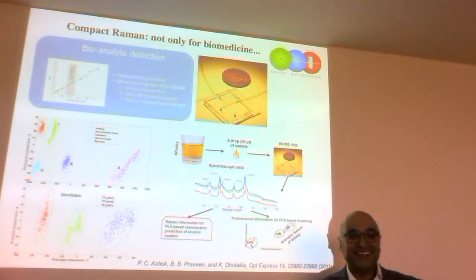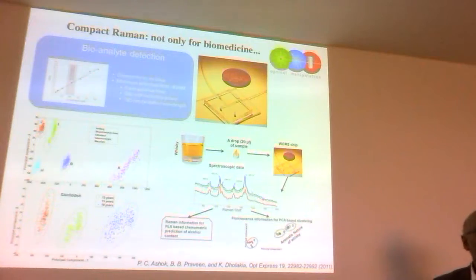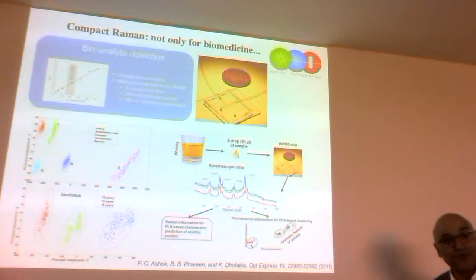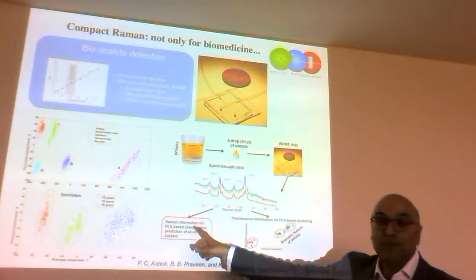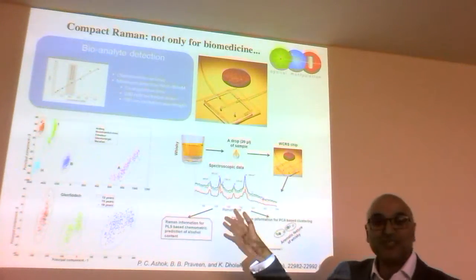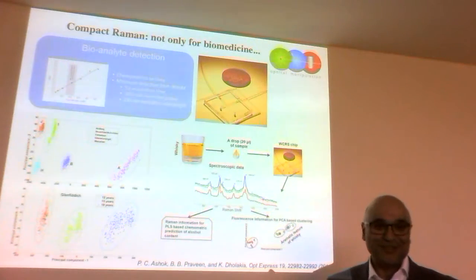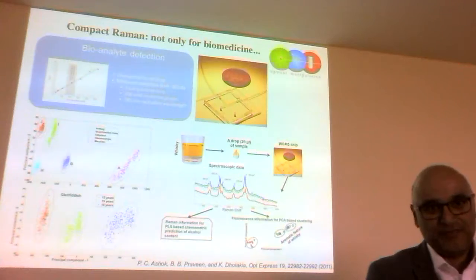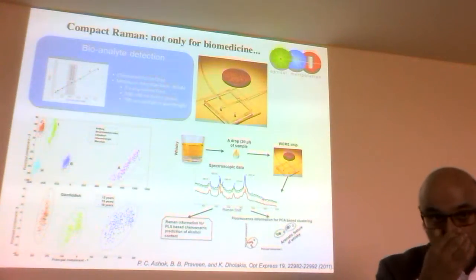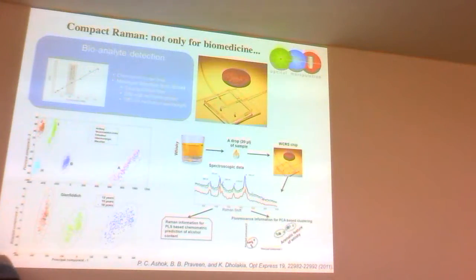Do you need just two eigenvectors to detect all of it? So the question is, do I need eigenvectors, or you mean principal component analysis? Usually yes, it usually improves the discrimination. If it's whiskies that are very different in colour, you can probably use something very simple to do it, but then you could probably use your eye or something much simpler. So you just selected the two of them, analyzing the eight values, or you just said, okay, we're taking two, and let's see if we can separate them just using two components.